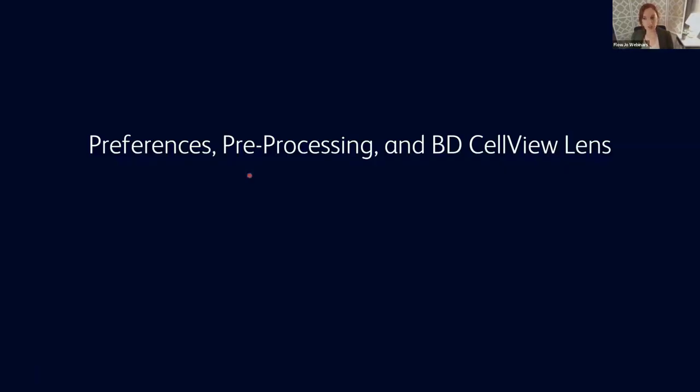Okay. All right, so for the rest of the time, I'd really like to talk about getting started loading your data in the software. How can we improve the experience? What are some of the pre-processing steps we can take? And then ultimately, how do we interact with the CellView Lens plugin?